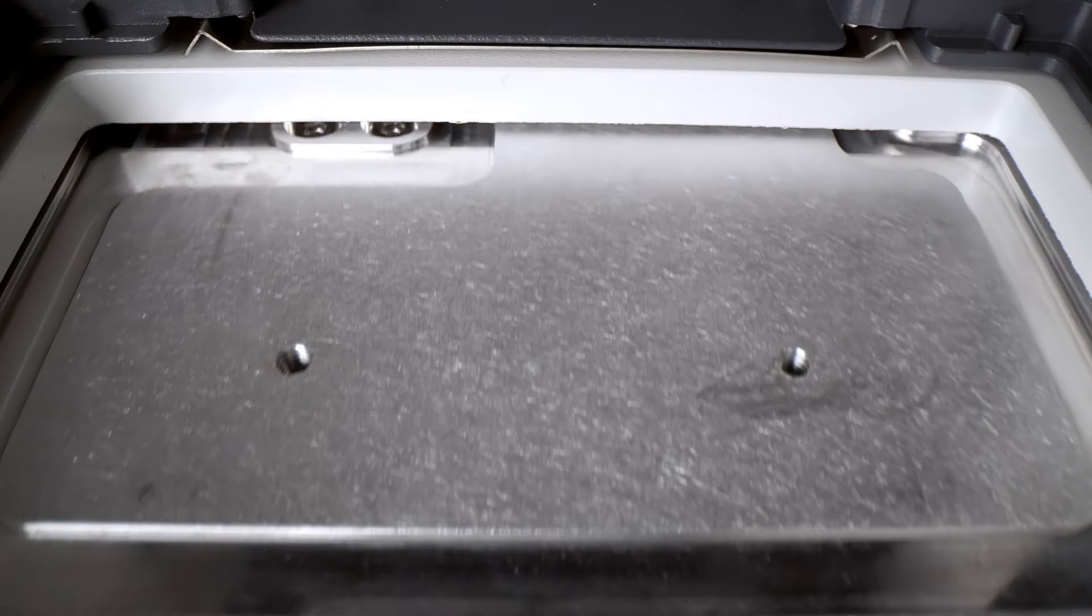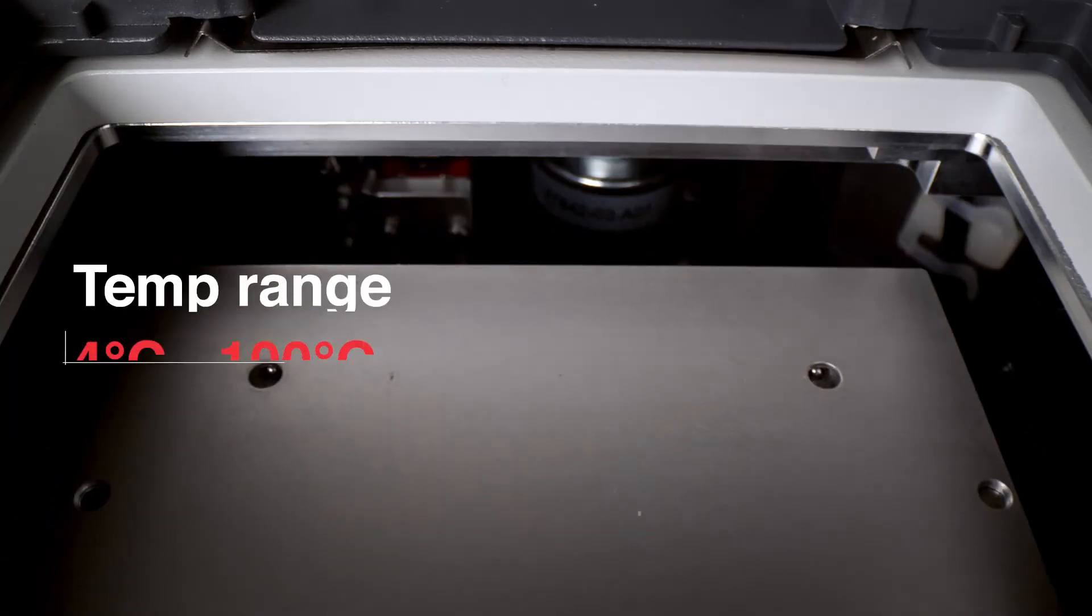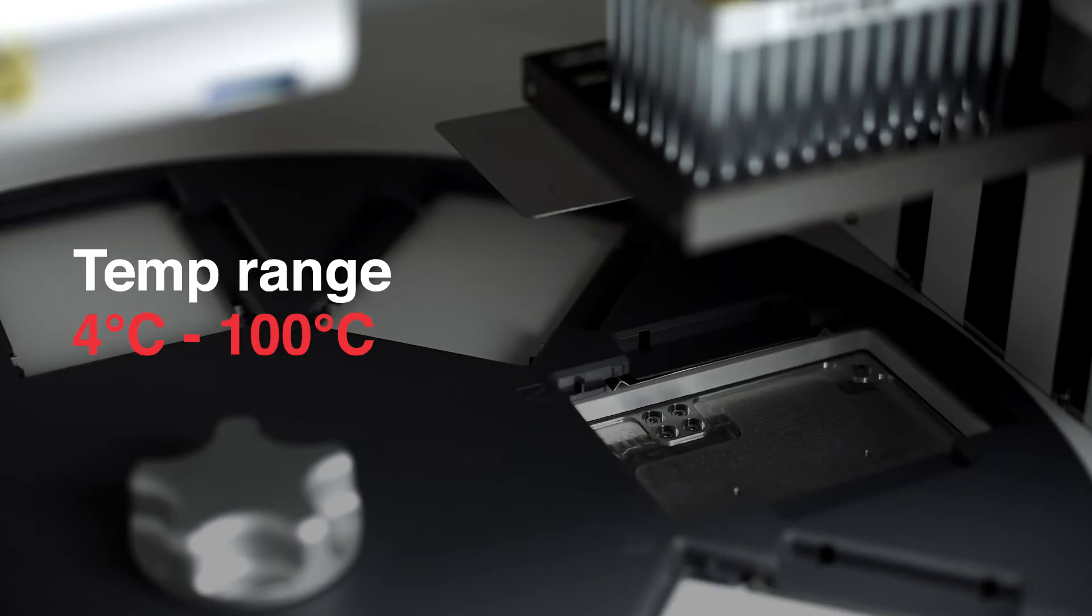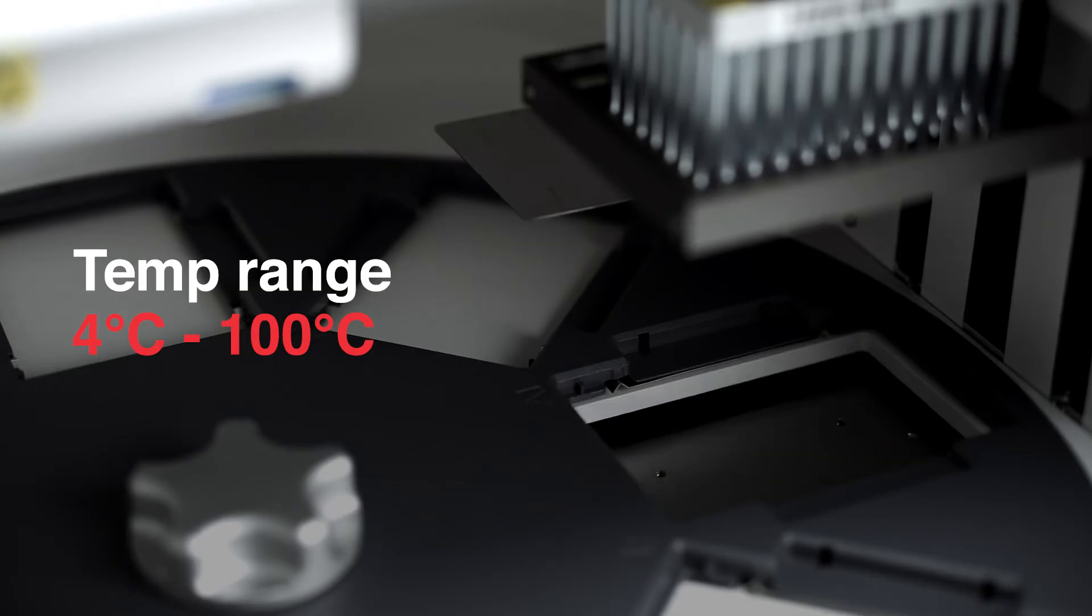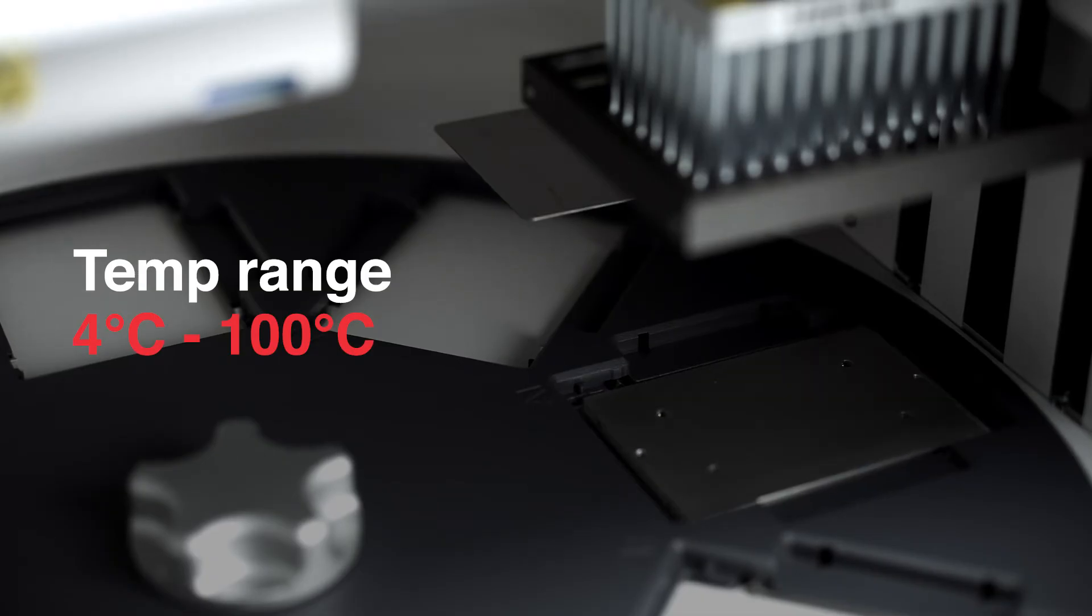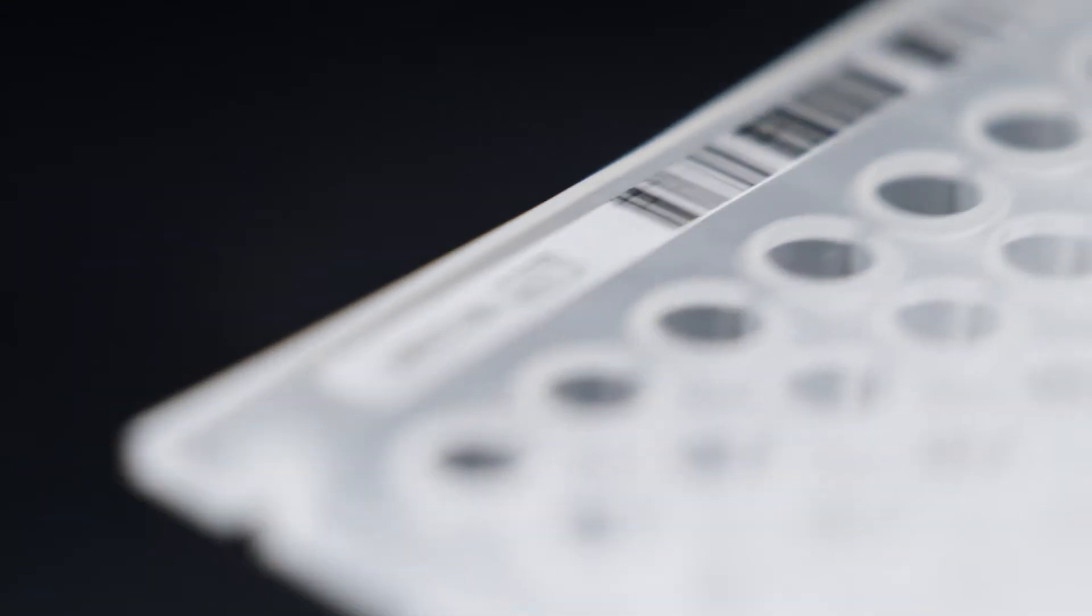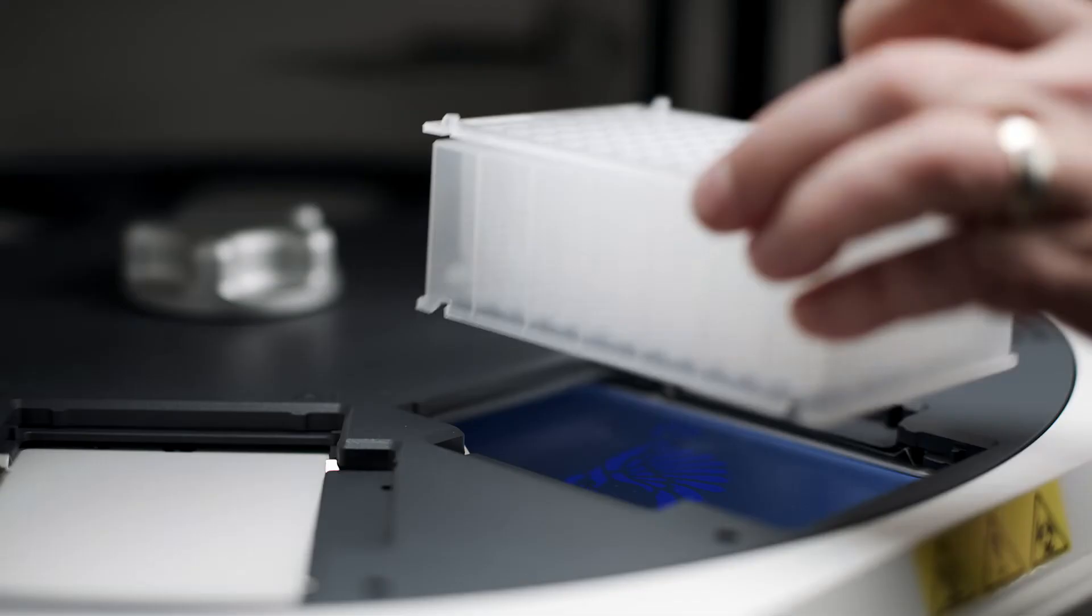Heating and cooling blocks are recessed below deck until needed, giving you tight control of sample temperature. You'll have the option to elute in screw cap storage tubes, so you can store it for later.